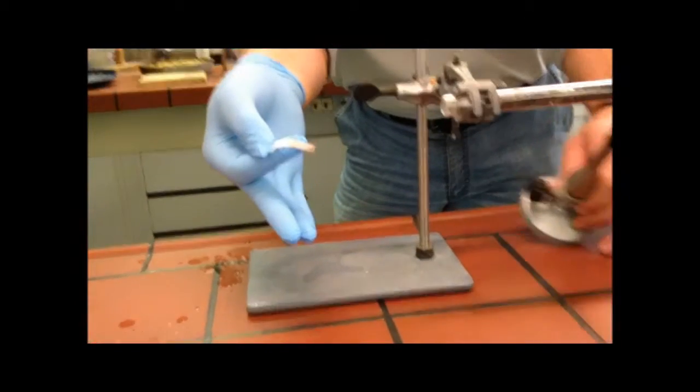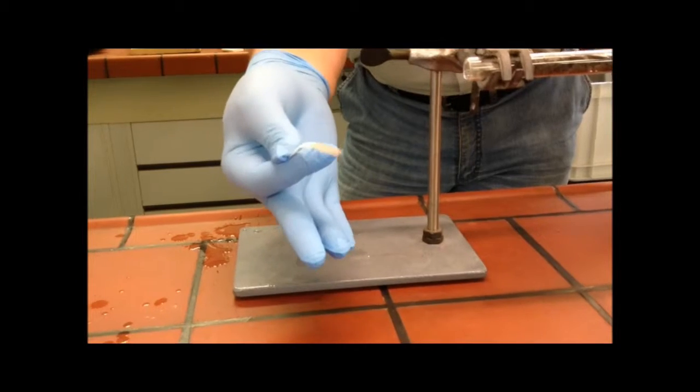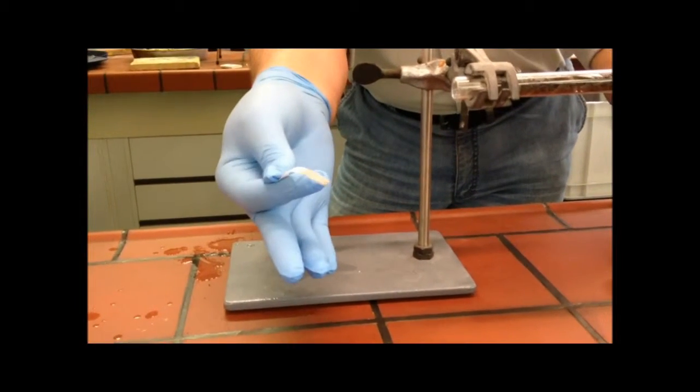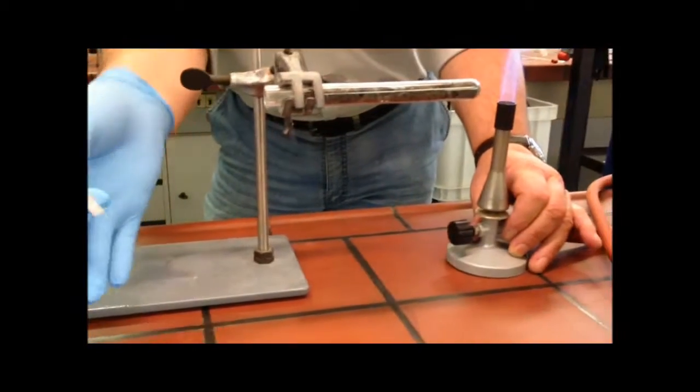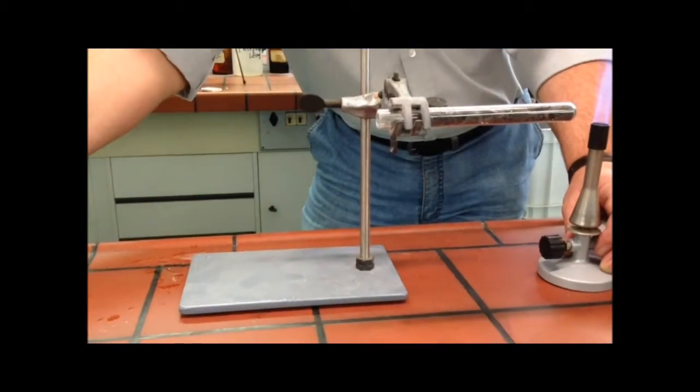One can now recognize by the black-brown discoloration that Schwefelwasserstoff gas has indeed been produced. This then colors the Bleiacetat-Papier accordingly.